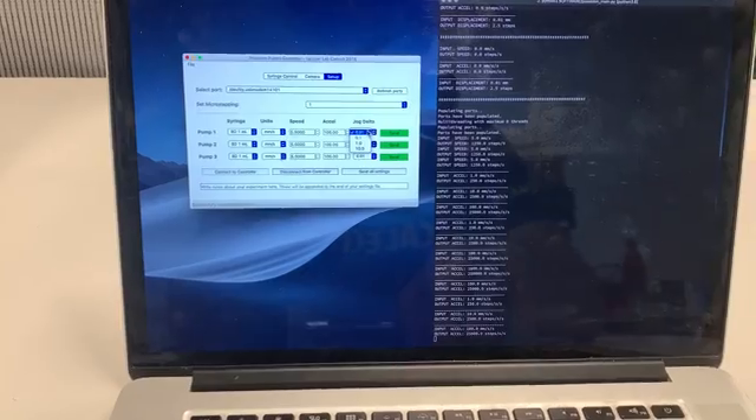We anticipate this will move the carriages one millimeter forward. Clicking it — looks pretty good. Now I'll switch from Jog Plus to Jog Minus, and these should move backwards. Looks pretty good.